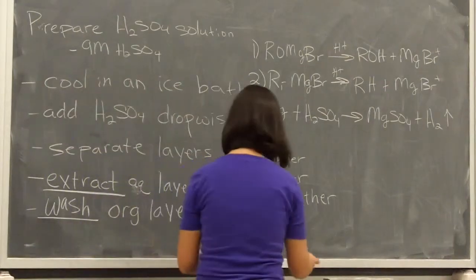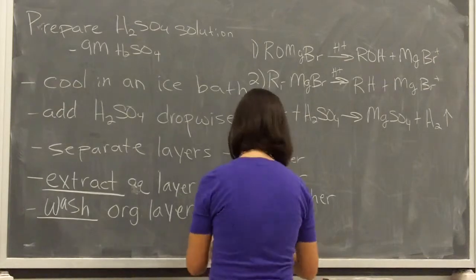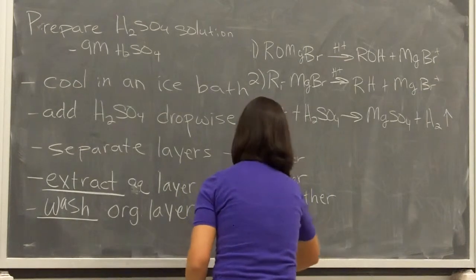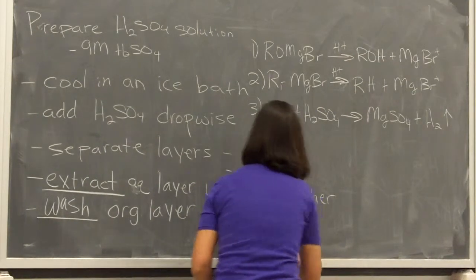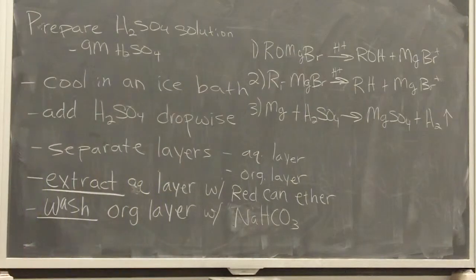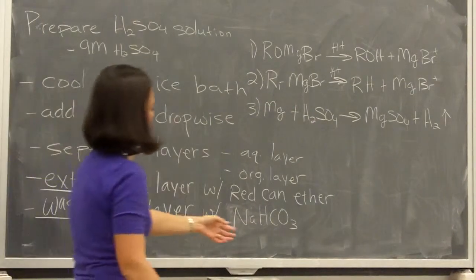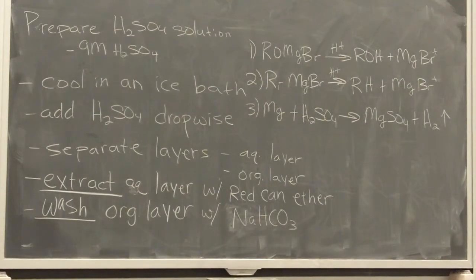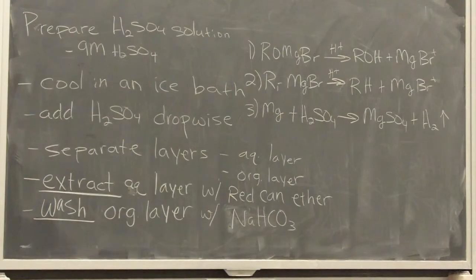And we're going to wash with water. Sorry, actually, in this case, not water, we want to use bicarb, because we want to make sure things aren't acidic anymore. So we want to get rid of all the acid so we still don't have potential for the elimination reaction. Okay? And there's 5% sodium bicarbonate solution in the reagent hoods.